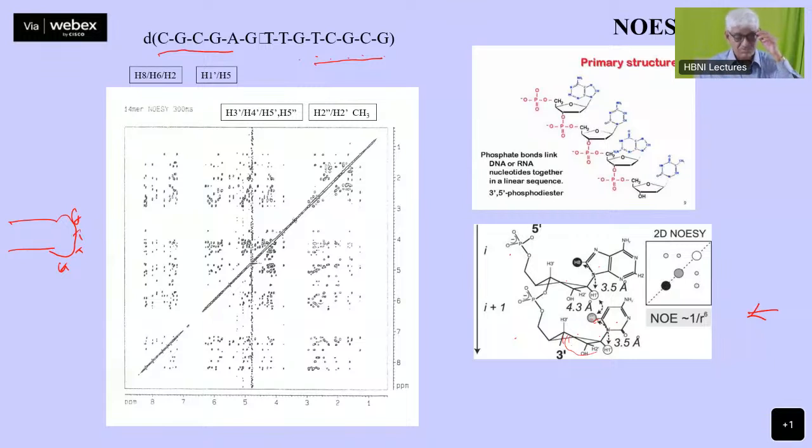Now you look at this spectrum, this is all very beautiful. All the 14 nucleotide units can be separately identified here. There is so much dispersion among the various peaks. You see various kinds of cross peaks. You see cross peaks between the base protons here and the sugar protons here. The CH3 belongs to what? CH3 belongs to thymines, and the 2' and 2" belong to the sugar ring. So you will have correlation from the base protons to the sugar protons here, and to the sugar protons here, from the methyl to all of these here, and also to the base protons here.